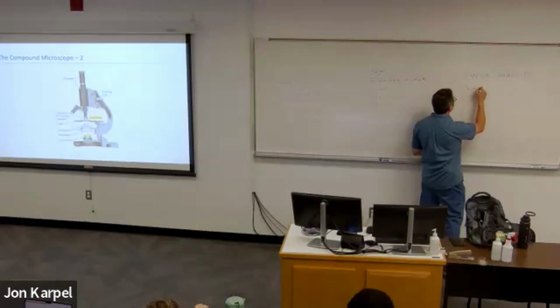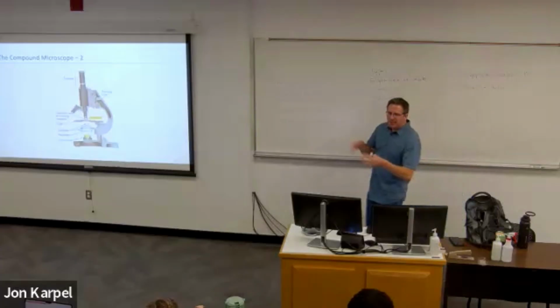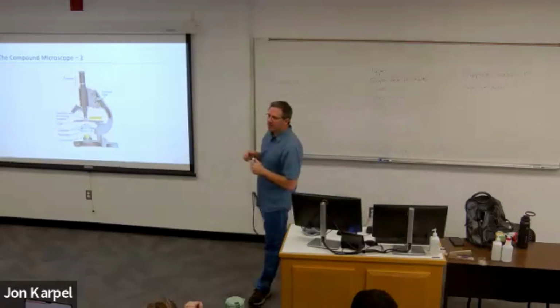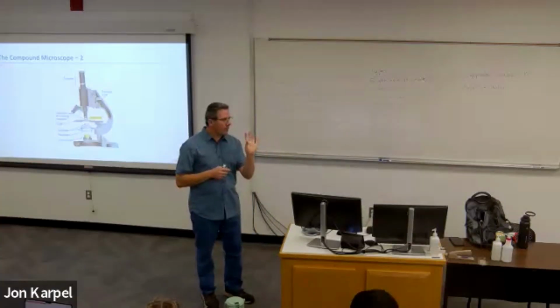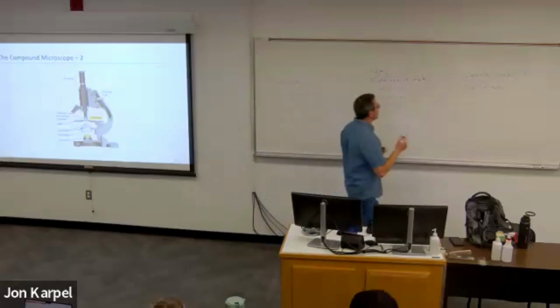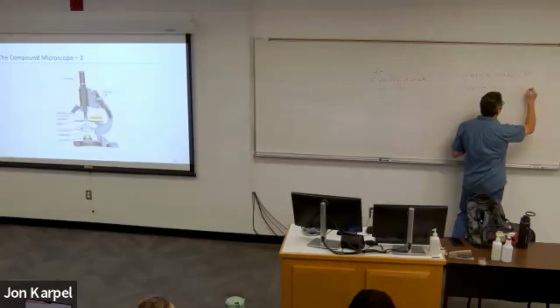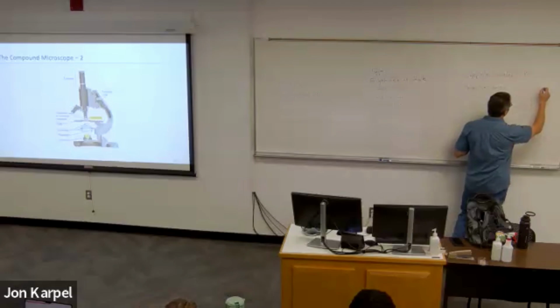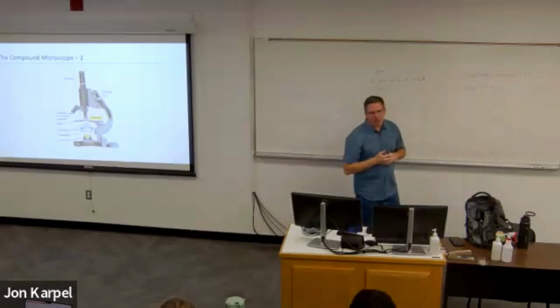You guys remember using this in Gen Bio at all? Maybe not, okay. So hope some of you might have been exposed to the microscopes, but you'll turn the objectives and you always start. I know I'm getting into a little lab stuff here, but that's okay. You always start on the 4x, 10x, and 40x. You always start with the lowest magnification.